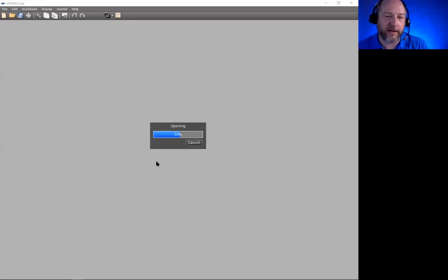This is what we call a Capstone Workbook. We've already learned the workbook is just that white space we can put things in. And so far we put in tables and graphs, but we can also add to the workbook images and text. And this text and images could be instructions. We can even add questions and places for students to respond to those questions.